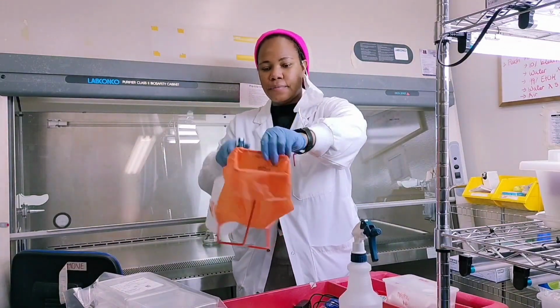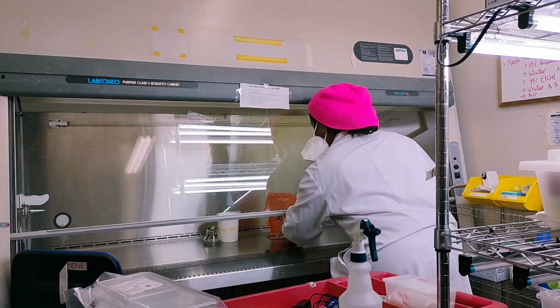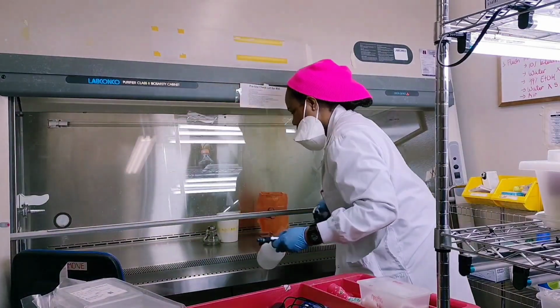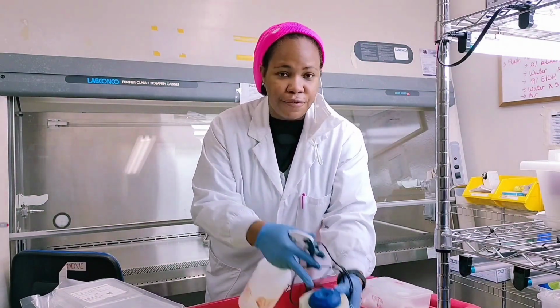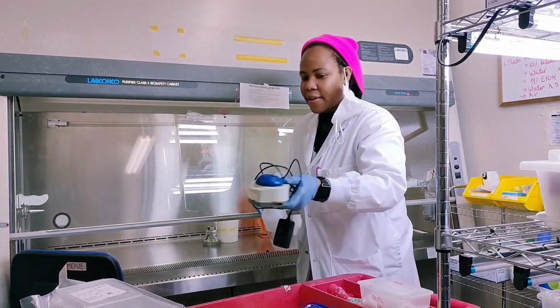The bag for the garbage. I keep a bottle of ethanol in there just in case. This is the vortex for mixing or agitating.